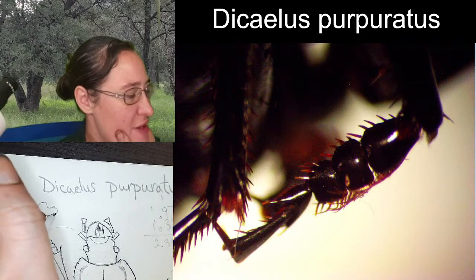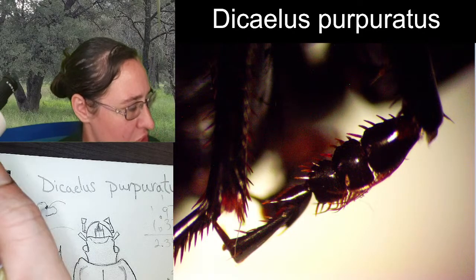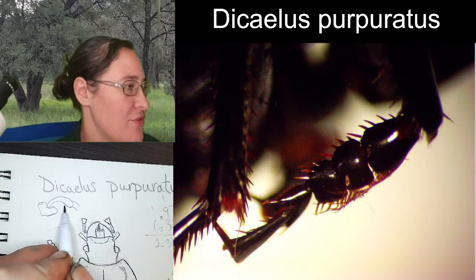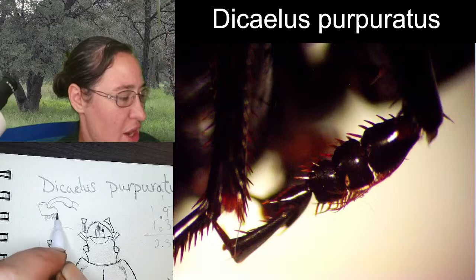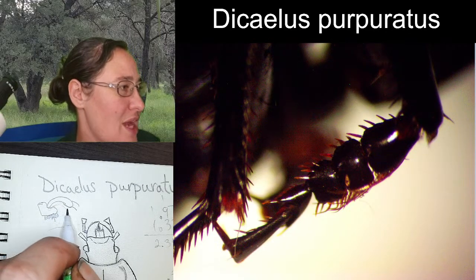If you look at it from the side, it looks kind of like this, where there's this notch here, and then the fifth tarsal segment comes out from it here. And this would be the bottom, so it's where you've got all that friction hair and those pads. And then the final segment kind of folds out of it.